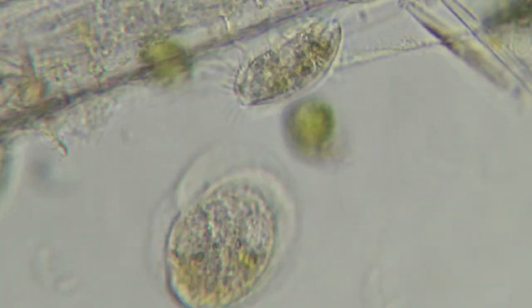There you go. See the kind of jerky motion it has? And now it's going to try to walk on. So see right now it's walking on the diatoms. Look at the cirri like little legs. So cool. Look at it. It's walking. Go walk. Just like a little beetle.